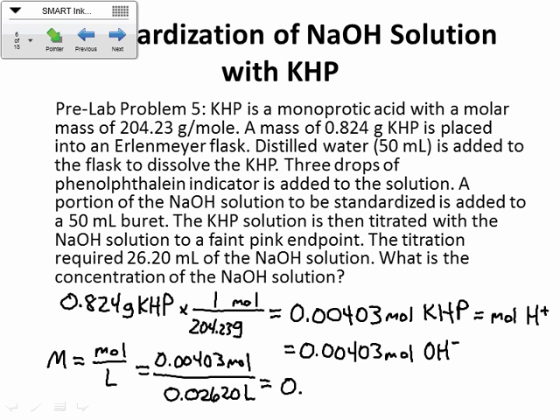Should give us a concentration of about, so the right number of sig figs is 0.154 molar. Okay? Now what we just did is we standardized the NaOH.